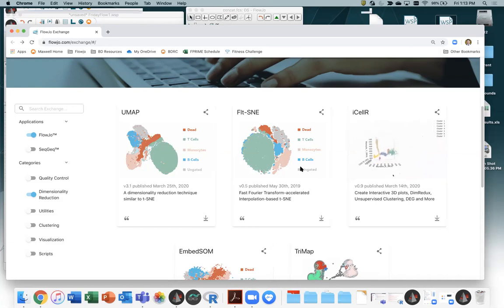So what t-SNE does is it just figures out which cells are near each other. It calculates the nearest neighbors to every cell, and then it attempts to make a 2D version of that where we just make sure that the cells that are near each other are still near each other. Calculates the distances, pushes them together, measures the goodness of the fit in the low D space compared to the high D space using Kullback-Leibler divergence, and then tries to improve that by pushing similar cells together and then moving apart dissimilar clusters of cells in a second step. And so that's what t-SNE does. It's basically looking to make the nicest picture it can possibly make.